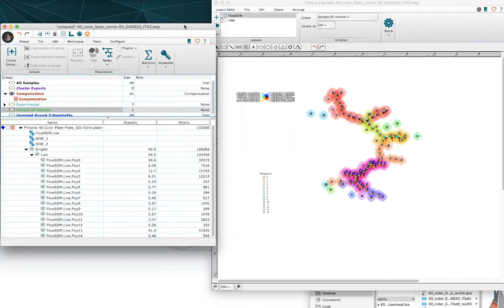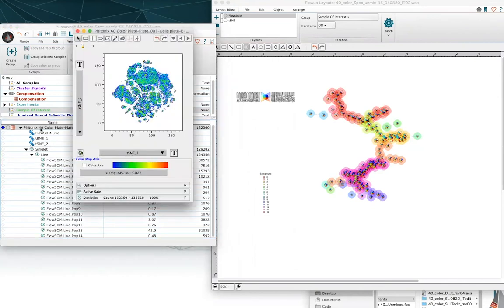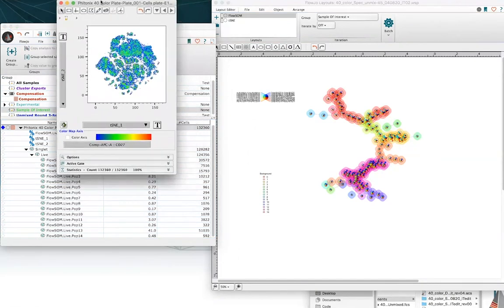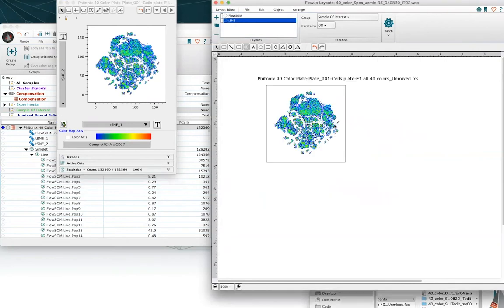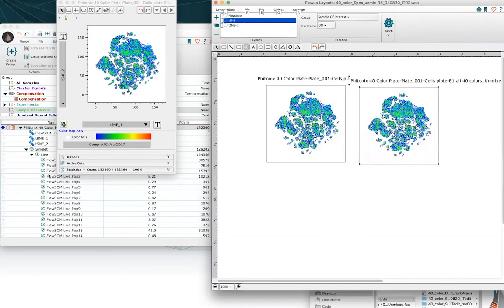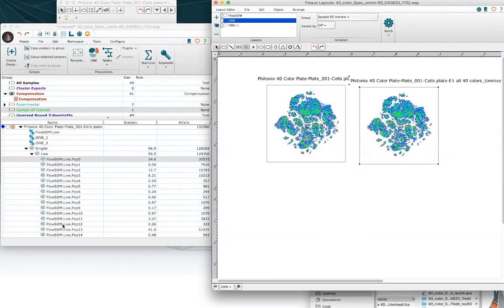To get us started, imagine that you've done some beautiful clustering — maybe you've used FlowSOM — and you've also got a t-SNE plot associated with that. You want to now look at the clusters of interest across t-SNE in the most efficient way and understand how those different clusters sit on the t-SNE plot. If you've got a t-SNE already set up, go ahead and duplicate this layout, and if I just overlay all of my clusters onto t-SNE space, we can see where they all sit.